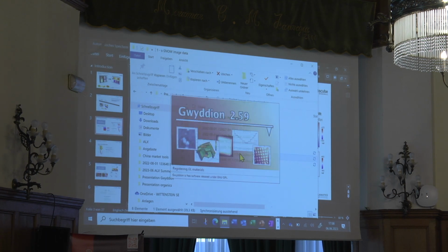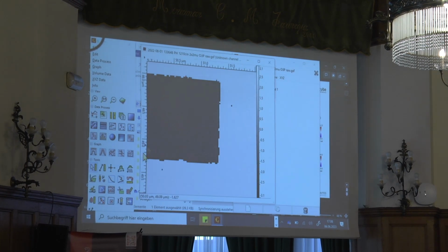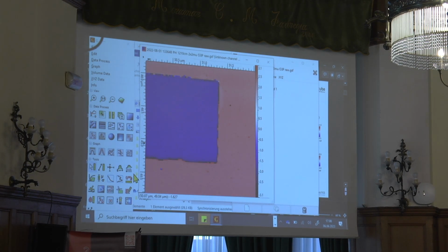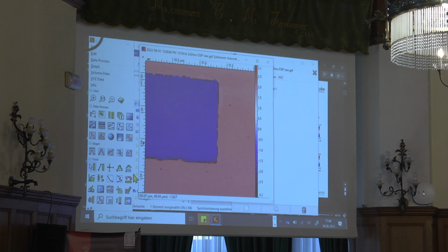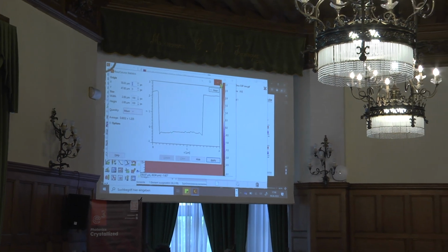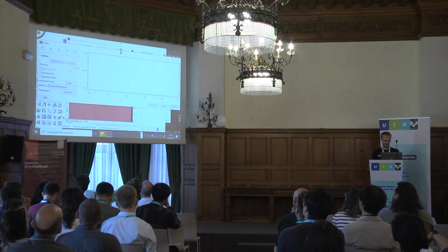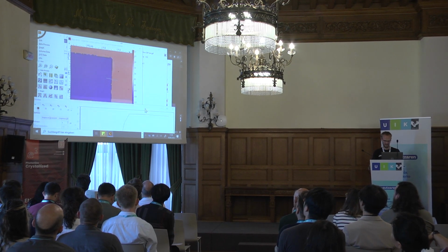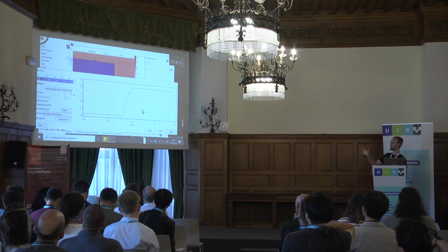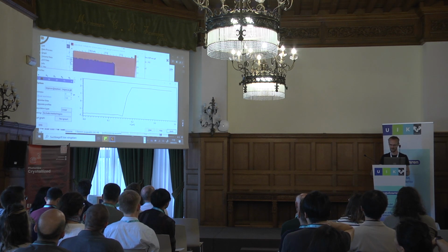And we're looking at the optical phase. So in this example, I know that if we plot here, in a different color scale, we can see there's a really strong contrast and it's really abrupt. If we make a line profile from the blue area to the red, we can really see that we have a super sharp jump here. It's from roughly -2 to +3. That's around 2 pi. And this is how you can identify there's something artificial going on.